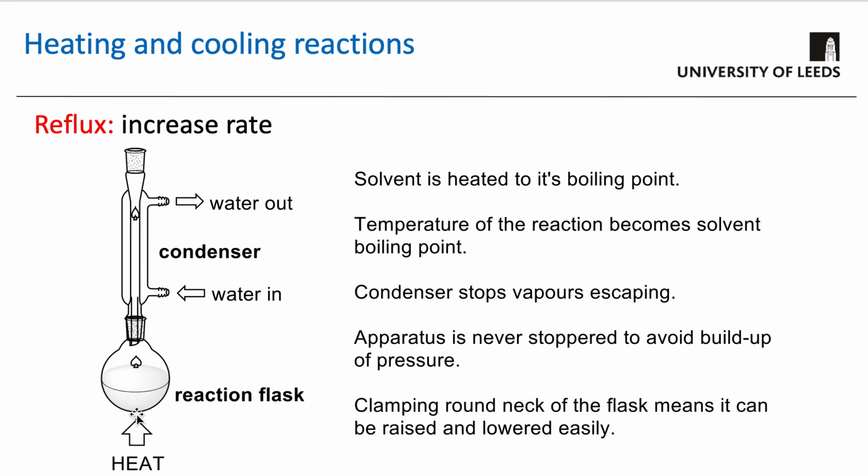And then what you'll do is heat the reaction to its boiling point. The thing that's going to boil will be the water, because that's what you've got most of in here. That's the solvent, the most of the liquid that you have in this reaction. So in this case, the temperature of the reaction will go to 100 degrees. Even if you set your hot plate to a temperature much higher than 100 degrees, inside the reaction flask the reaction can never go above 100, because as soon as the reaction reaches 100, the water starts to boil.